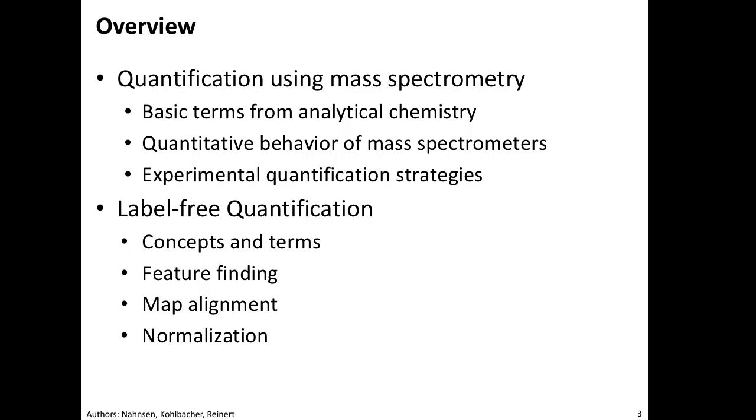We will then talk a bit about quantification strategies. So what type of experiment do you need to do to actually get quantitative information? What does this information look like? And I will then focus the second part of this lecture on label-free quantification. What are the concepts there? You will hear about other quantification techniques, MRM, and some of the other parts of the main institute.